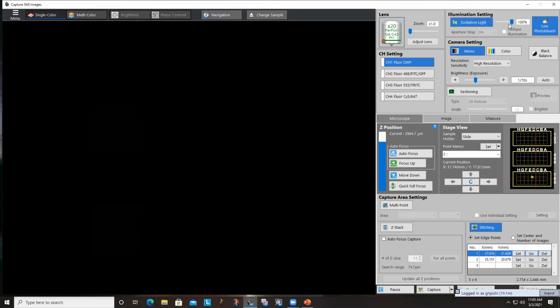My excitation line at the moment is at 100%. And I've enabled the low photo bleach mode.